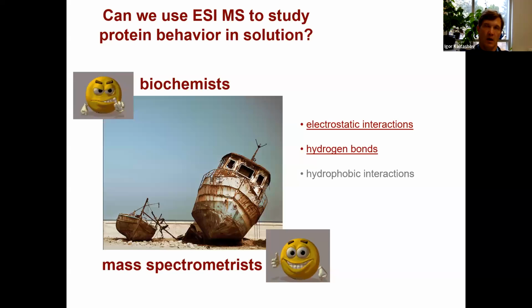So let's say you have a biopolymer assembly and you pull it from solution into gas phase, or it's actually vacuum. So it has very low pressure there. So there is no solvent anymore. And so the question that you need to ask yourself is, how does that affect the stability of high order structures, stability of all these non-covalent complexes, and so forth.